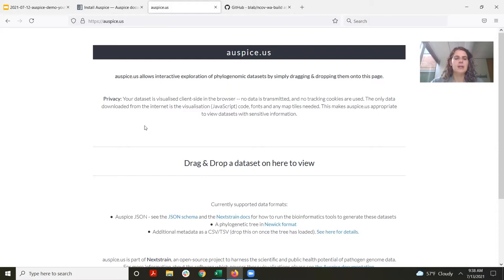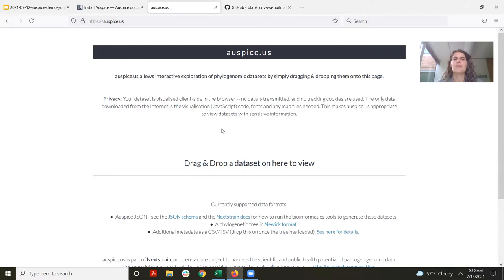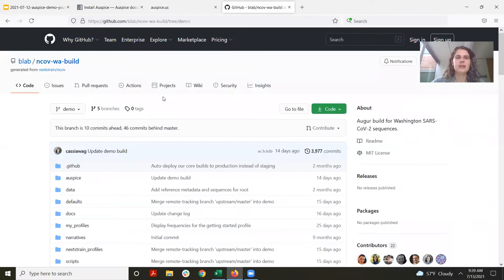Auspice is great because your data will never actually leave your computer — it always stays on the client side of the browser. So it can be a really great way to look at private or sensitive metadata without any security concerns. Of course, if you're using Auspice, it requires you to have that tree file locally on your machine. And if you're working with other team members or collaborators and don't want to be sharing big output files back and forth, we've developed another way called Nextstrain Community to solve this problem.